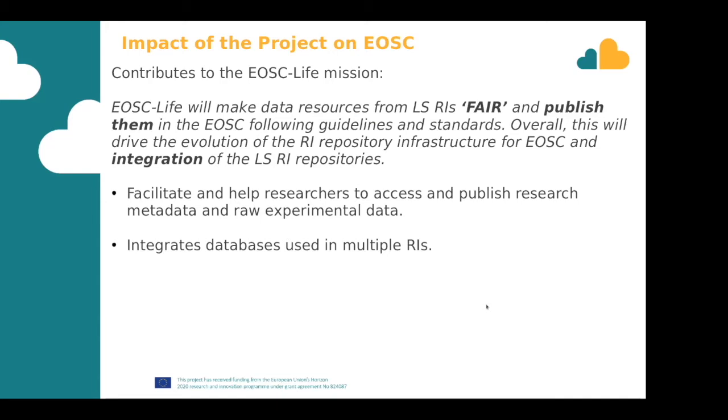And looking at how this would impact the EOSC-LIFE, the mission of EOSC-LIFE is to provide FAIR data policies and publish the data, and integration of different research infrastructures and structure repositories, and this is exactly what we are doing basically with this. Of course, it's a very practical example of this, facilitating and helping researchers to access and publish research metadata and raw experimental data. I think that's the key practical benefit for everybody using this software. And we also integrate with databases used in multiple synchrotrons now in Europe.